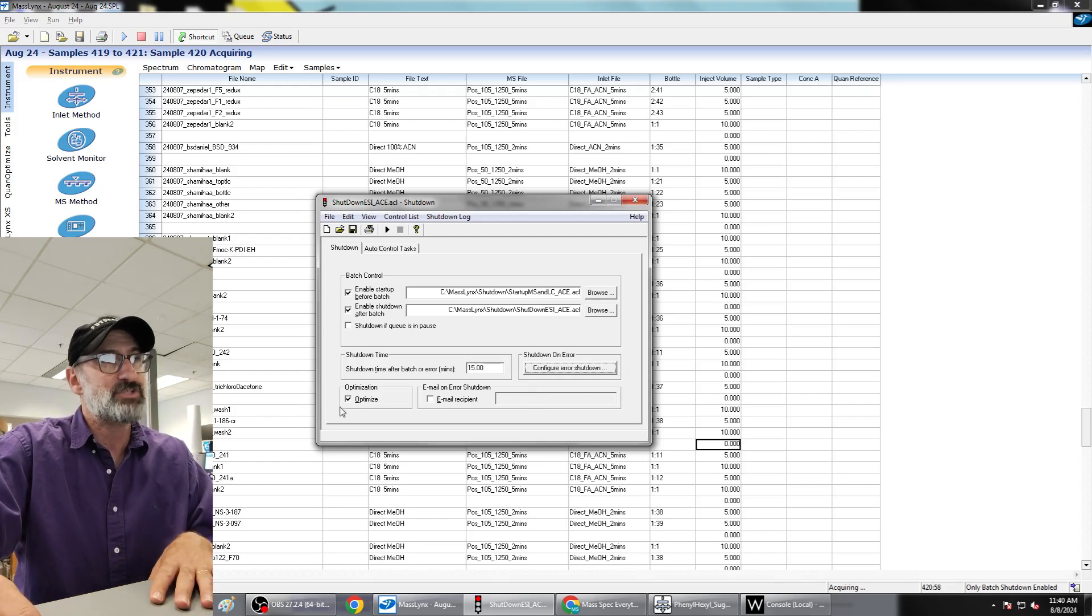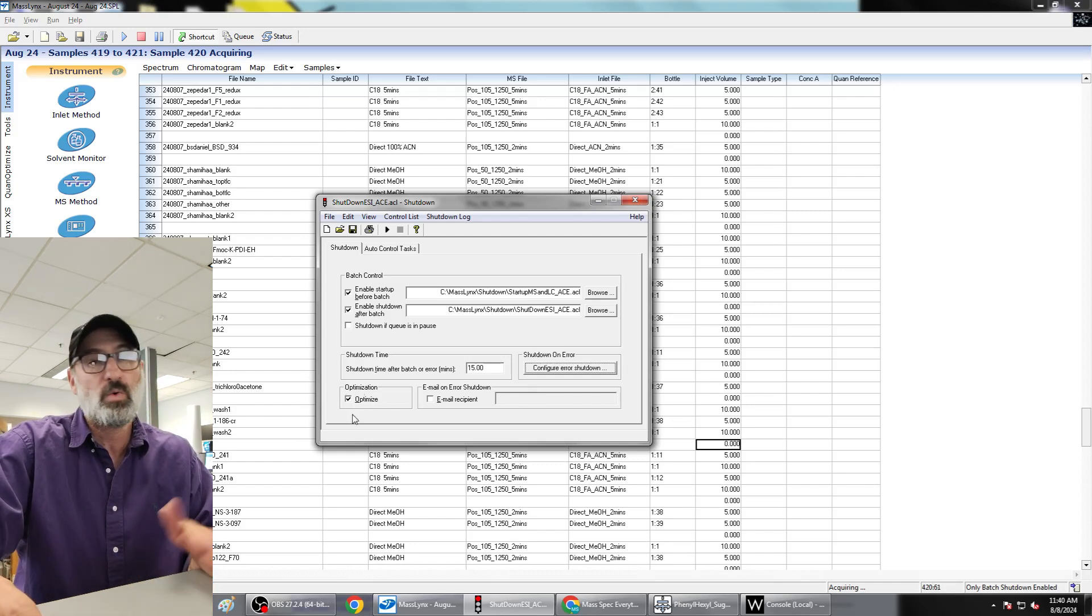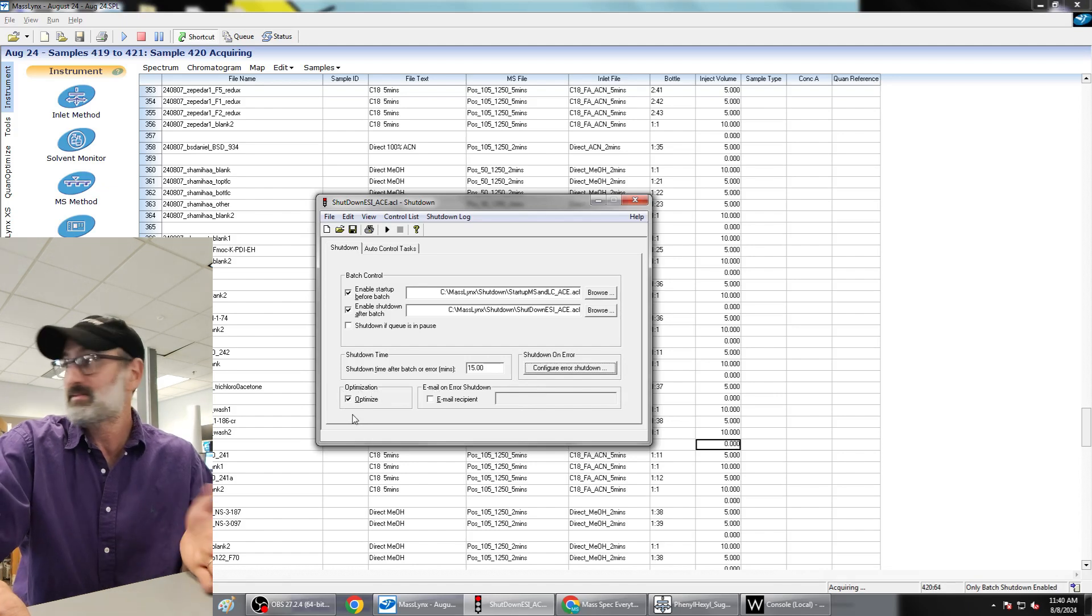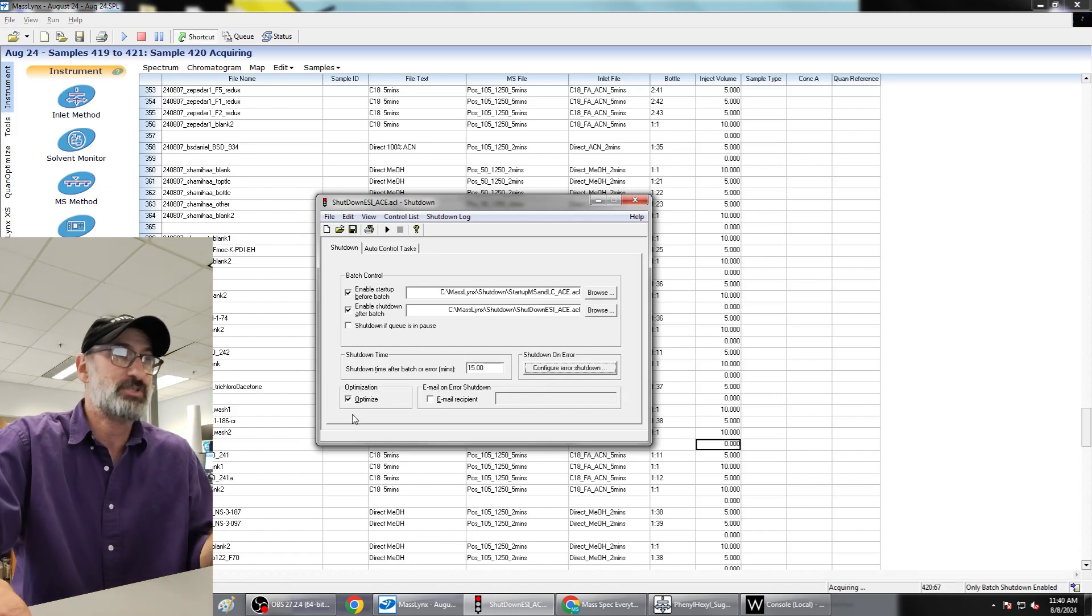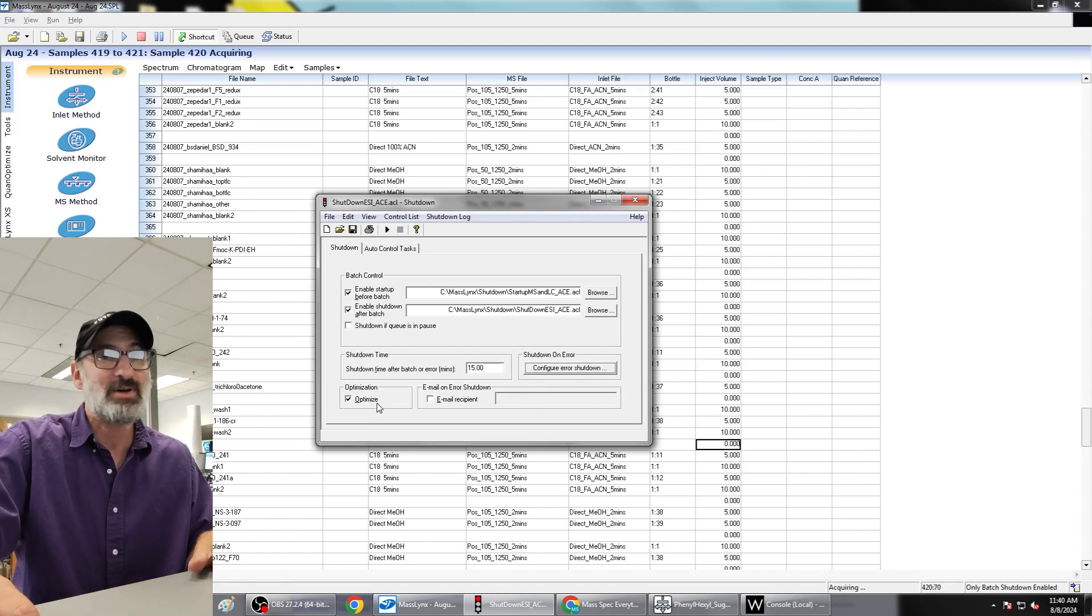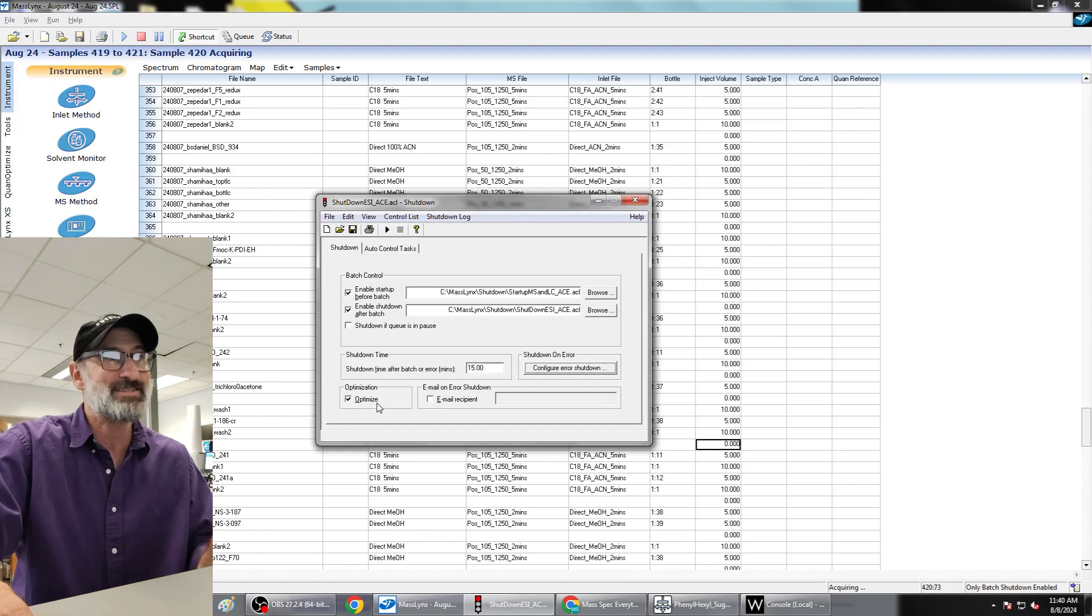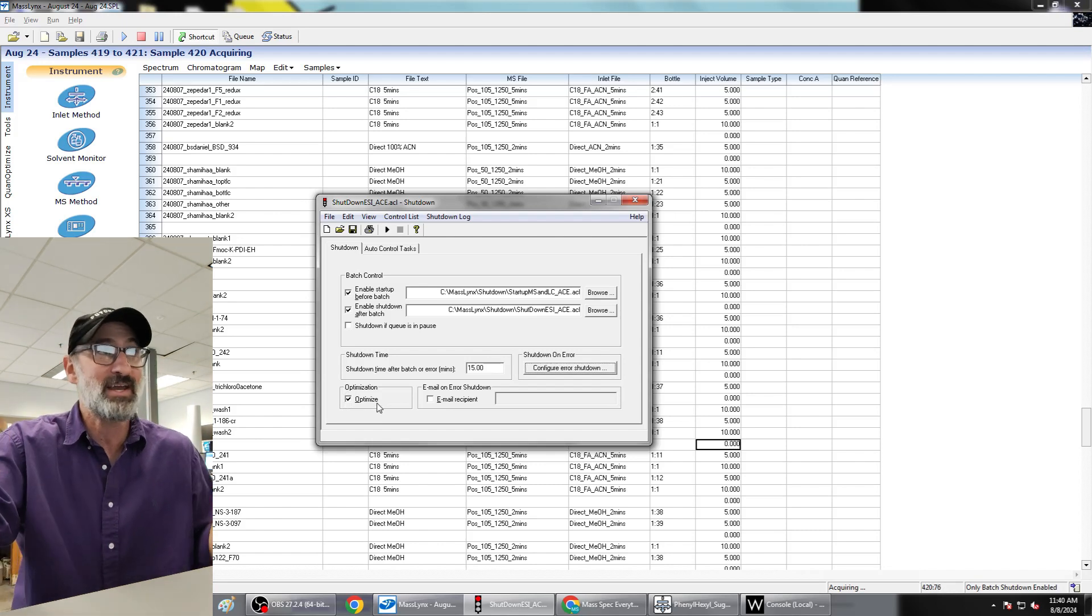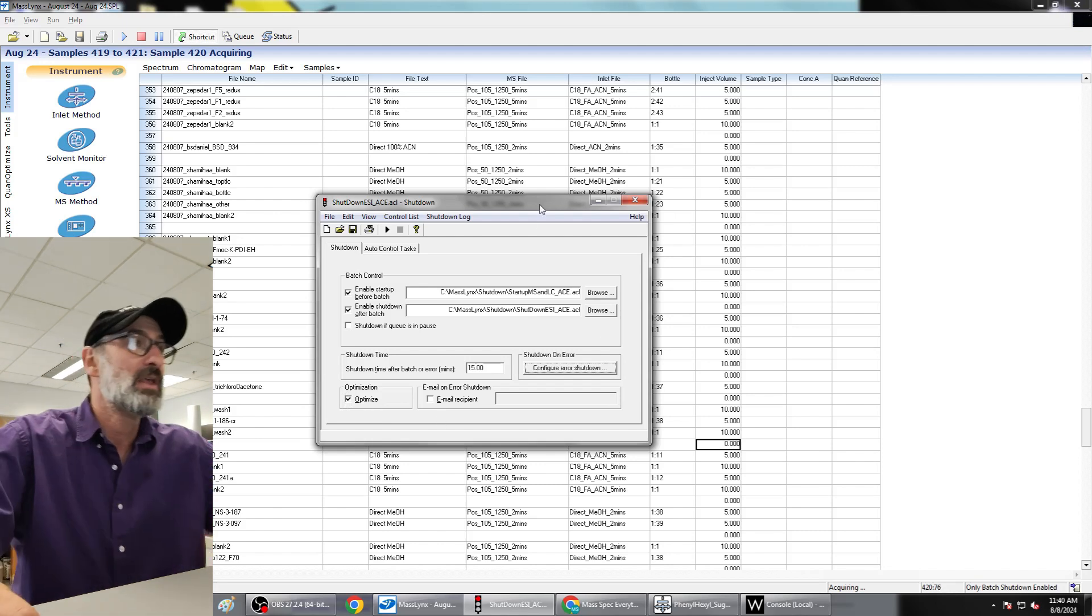The other button you always want to have checked is this optimize button. I don't know why they even have it exist, it should just be always checked. Make sure the optimize button is checked, otherwise it will not use any of your custom setup stuff.